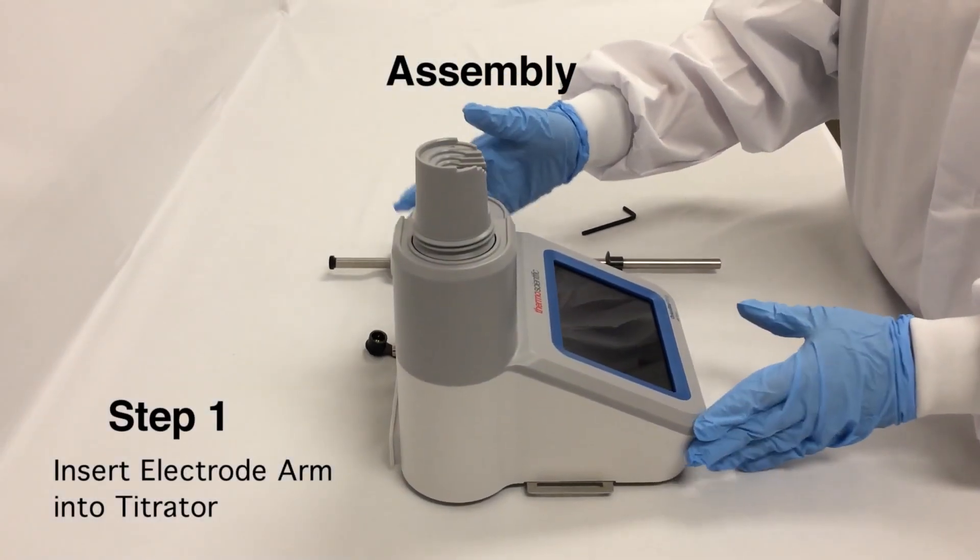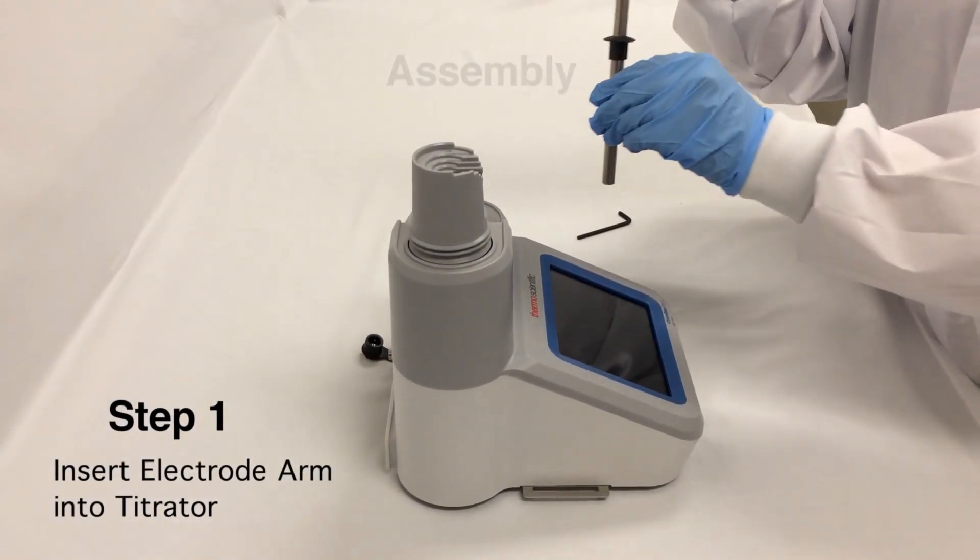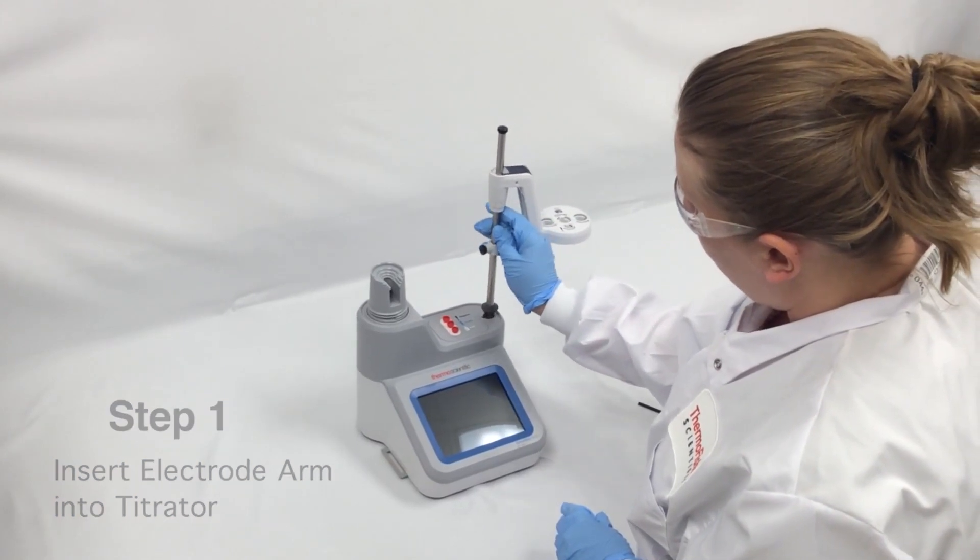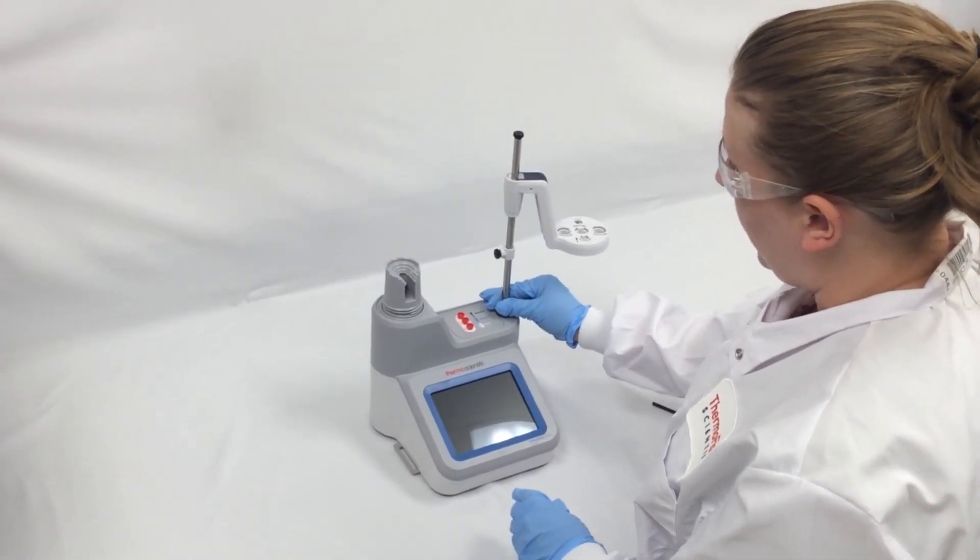The first step in the assembly process is to take the electrode arm and insert it into the titrator, lining up the slots.